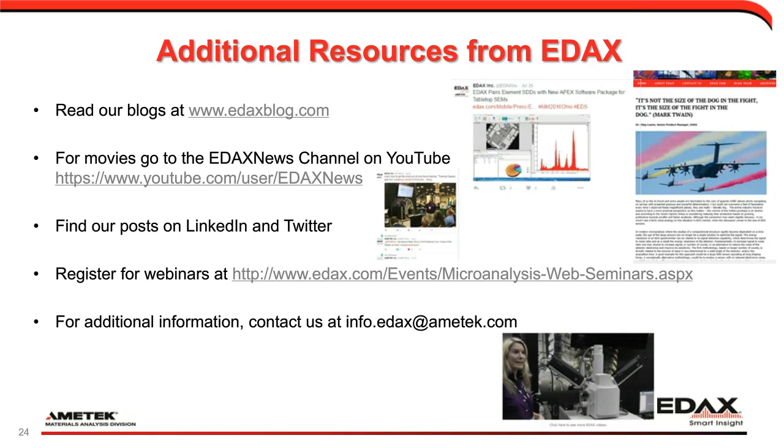Jens, I'd like to take one of the questions that somebody had asked about the slide that I showed, the 7 selectable amp times overlay. Those were collected at 10,000 counts per second for a collection time of 10 seconds. So you can get very nice looking data like that, nice looking spectra in just 10 seconds at moderately low count rate and without really any statistically grassy looking spectra.